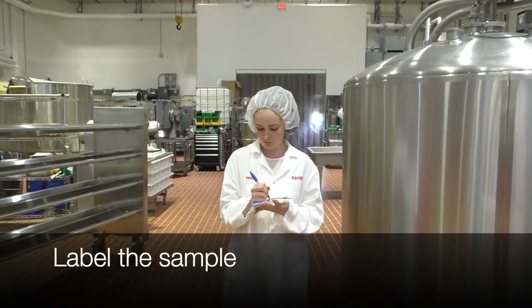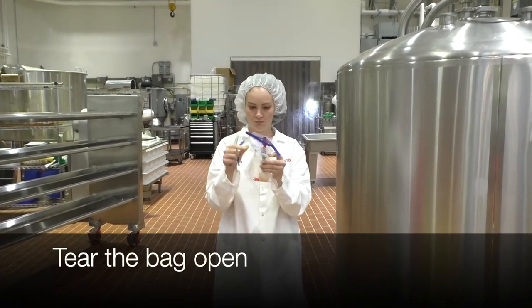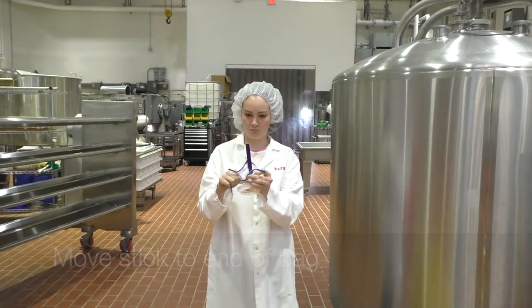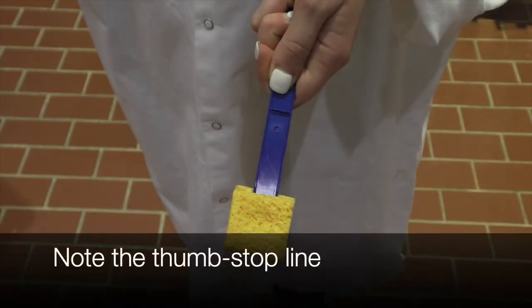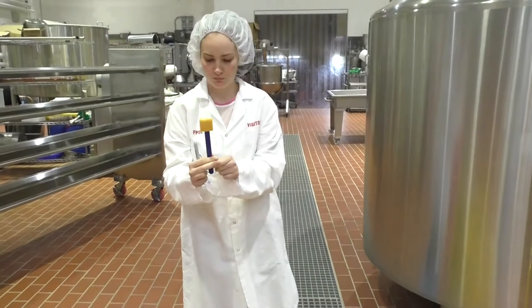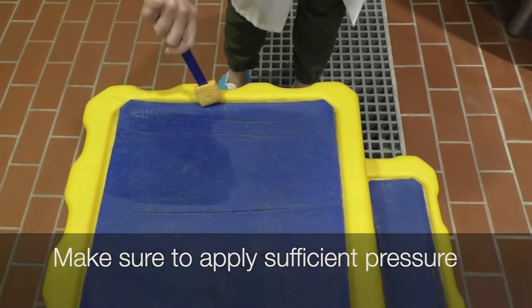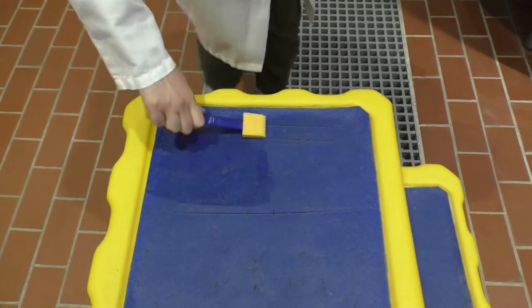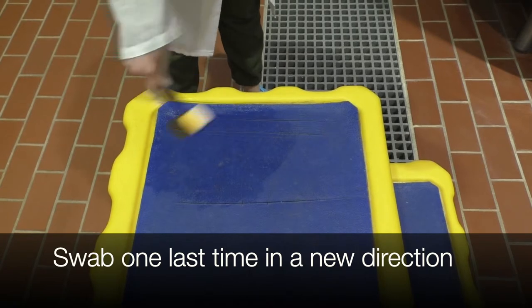Now we will cover sponge sticks. Label the sample bag with a permanent marker for identification. Tear the bag open. Move the stick to the end of the bag. Aseptically grab the stick above the thumb stop line to remove the sponge — don't put your hand inside the bag or touch past the thumb stop line. Aseptically swab across the entire sampling surface, making sure to apply sufficient pressure. Aim to use both sides of the sponge surface. Turn the sponge stick over and sample the same site one last time, swabbing in a new direction.